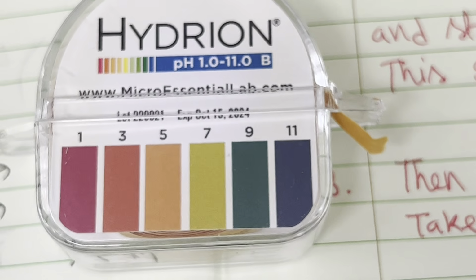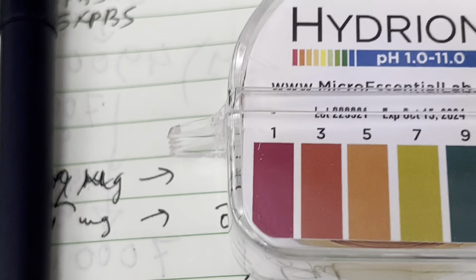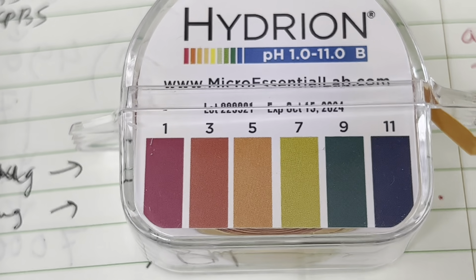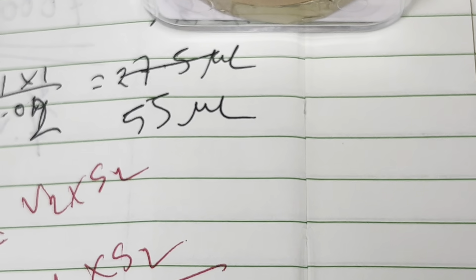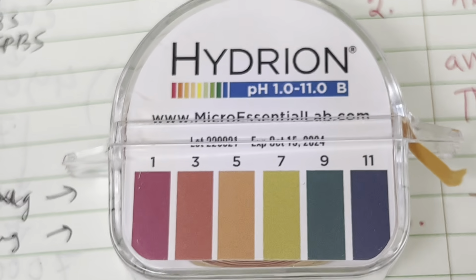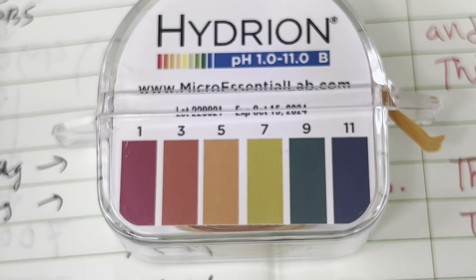What is 5? What color is 5? What do you see? I see orange. Is it not orange? Wait, is 7 orange? 7 is kind of greenish yellow. And 5 is not greenish. 5 is, I don't know, not deep red, somewhat red. And then 3 is red. Yeah. And 1 is dark red. Okay.